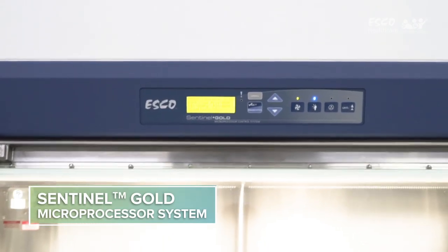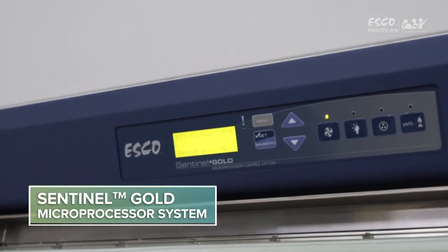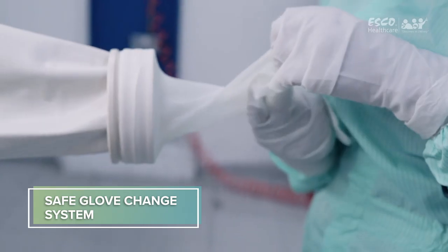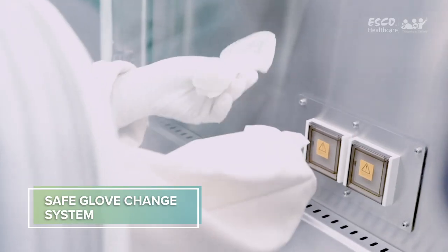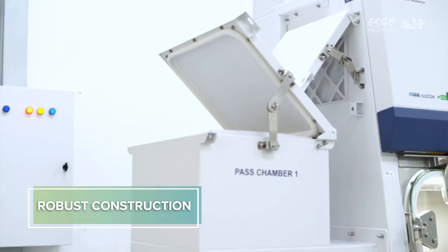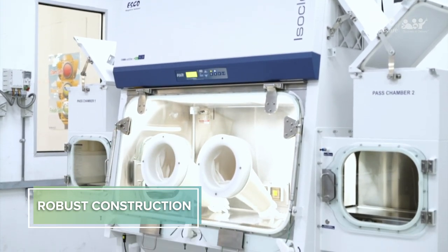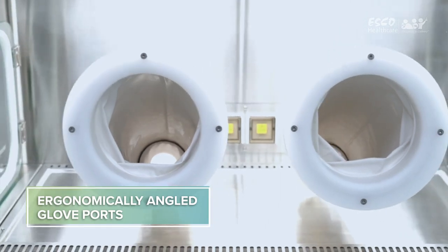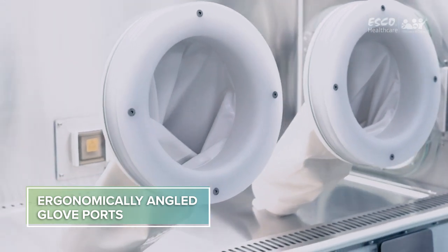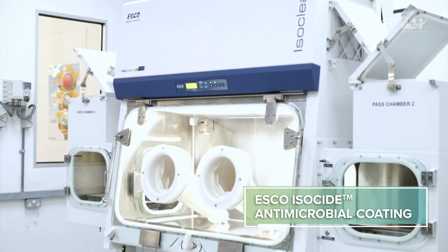The Sentinel Gold Microprocessor System supervises all functions and monitors airflow and pressures in real-time. Safe Glove Change permits zero risk of contaminating the work zone or environment. Robust construction and enhanced safety features qualify the IsoClean Healthcare Platform Isolator for the most demanding laboratory applications. Ergonomically angled front glove ports improve reach and comfort. Esco IsoCyde antimicrobial coating on all painted surfaces minimizes risk for contamination.